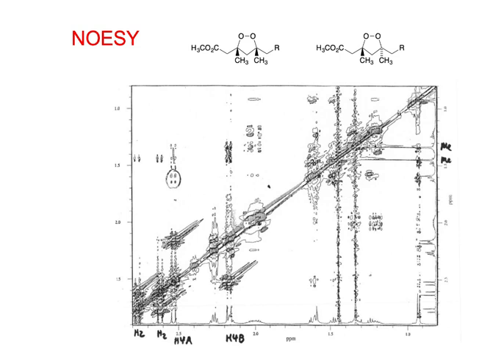Okay, so here's the two possibilities for stereochemistry, right? These two methyl groups could be on the same side, or they could be on opposite sides. So cis or trans or syn or anti, whatever. Okay, and so what we are going to look at is the two protons in the middle here, let's put one with a wedge and one with a dashed line.